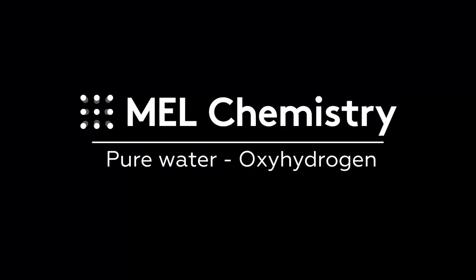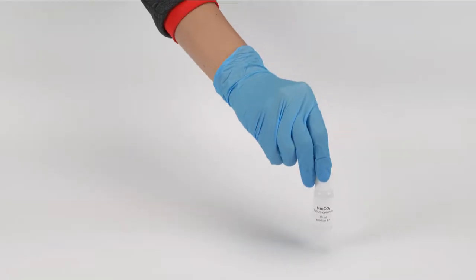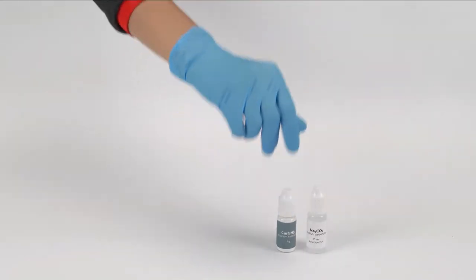For the oxyhydrogen experiment, you will need a solution of sodium carbonate and a bottle of calcium hydroxide.